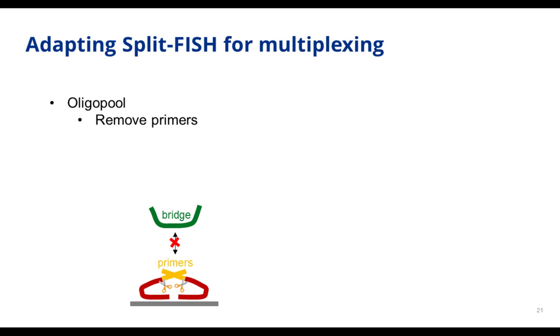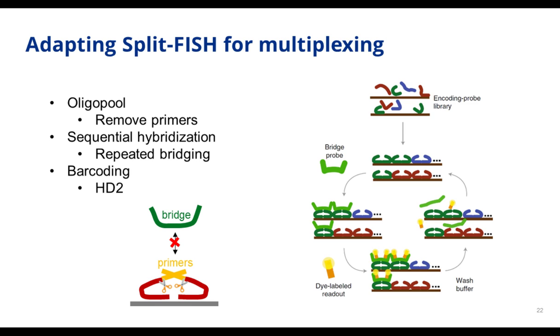So we did more optimization to adapt it to an oligo pool so that it can be in a big pool of 100,000 sequences.